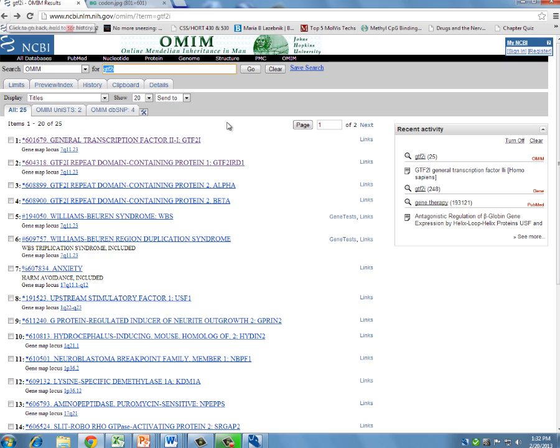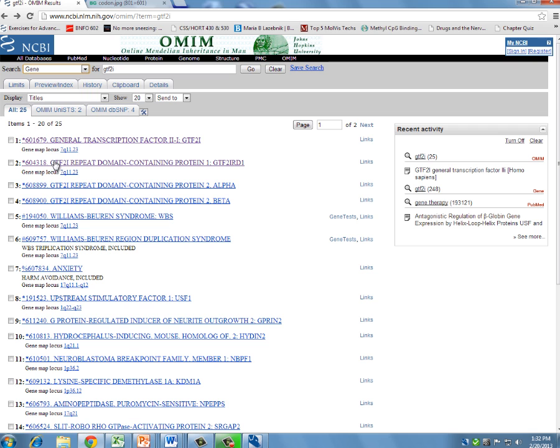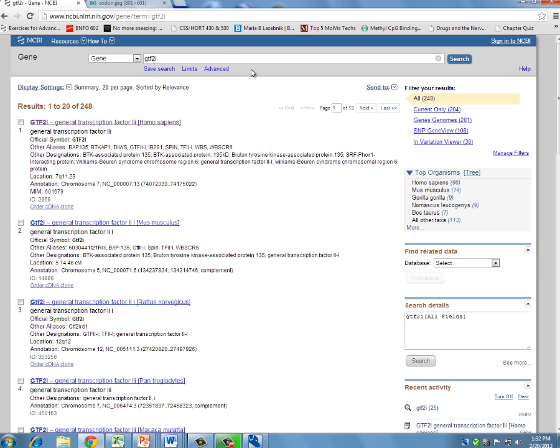So the next part of your report is step 3, and so let's go back to gene here. So gene, and press go. So let's click on this gene again.